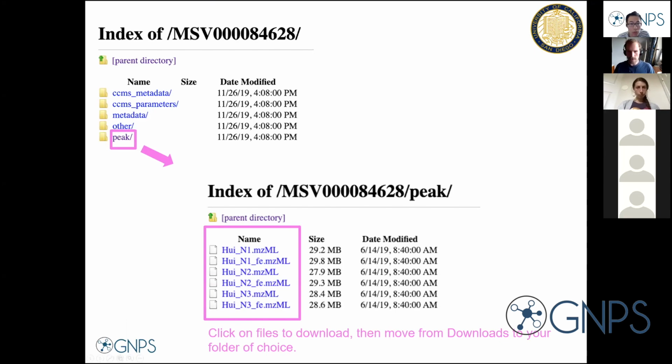Okay, who does not have that data on their computer right now? Do you want to indicate this by thumb down, maybe? Okay, I don't see any thumbs down. So I assume everybody managed to download the data. Oh, I think one person has it still downloading. So maybe we could give a minute just for maybe some slower internets.